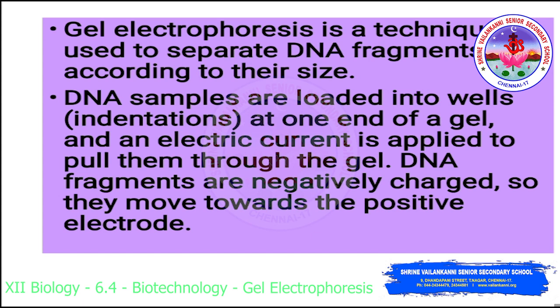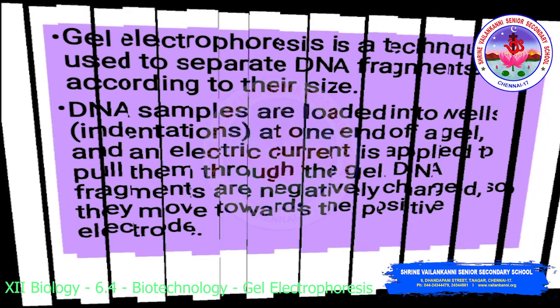DNA fragments are negatively charged particles. So obviously the negatively charged particles will move towards the positive electrode. So this will be the principle followed for gel electrophoresis. So they move towards the positive electrode.